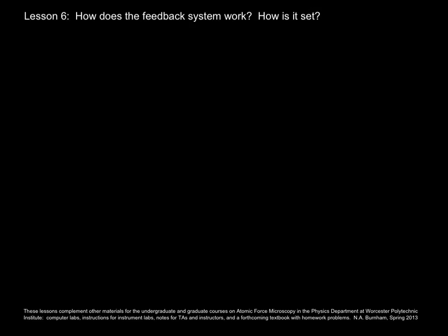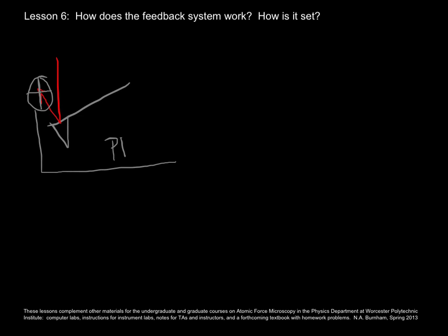In the first 5 lessons, I gave you an introduction to atomic force microscopy. Now we're at lesson 6, and it's time to get into some details. And one of the most important set of details is that having to do with the feedback circuit.